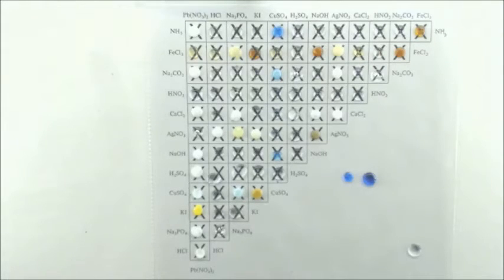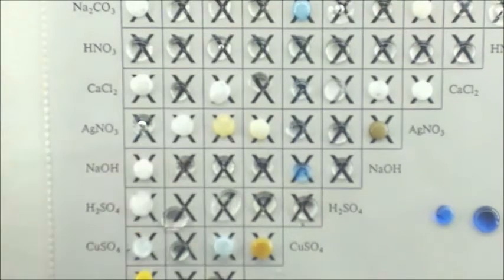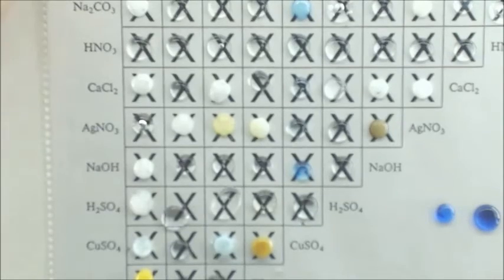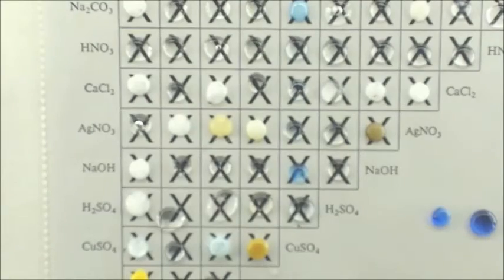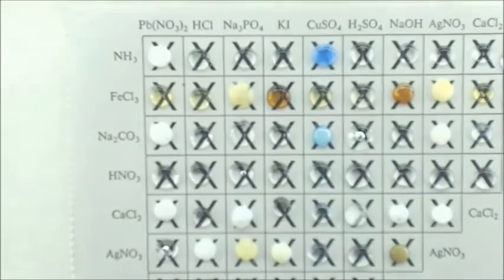Let's try zooming in here just a little bit as well. I've got it taped down, so let me release this, trying not to spill these things. I shifted a couple of them up there at the top. All right, so here's the grid up at the top that gives you a better view of some of these.